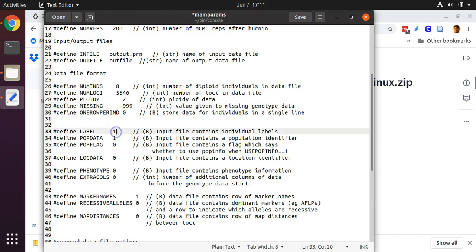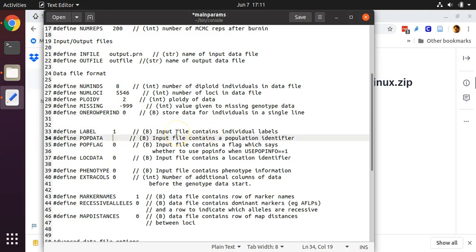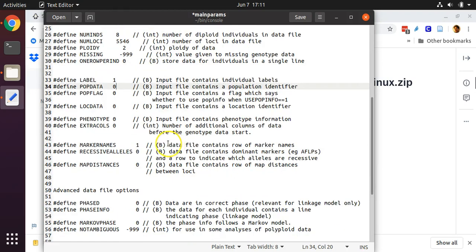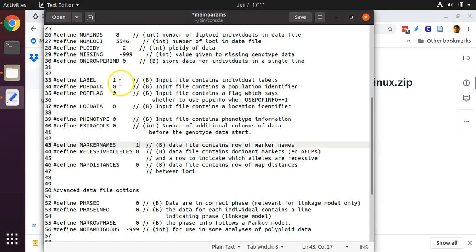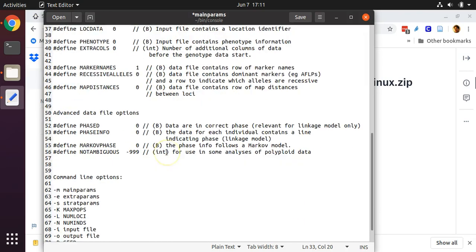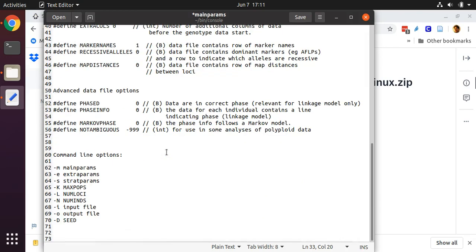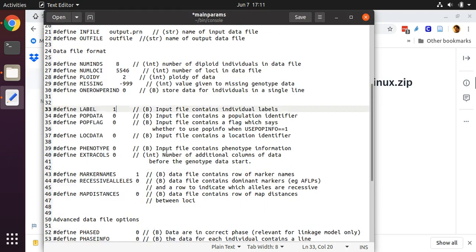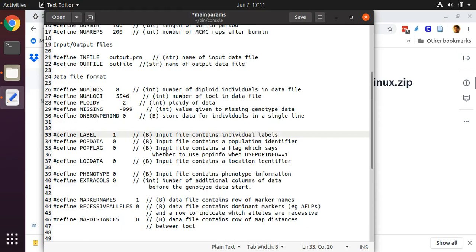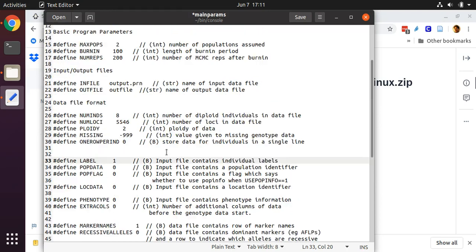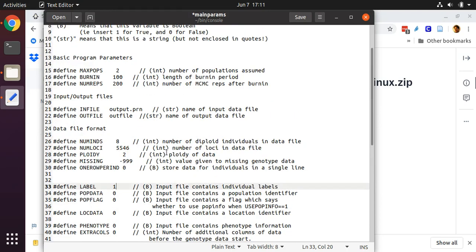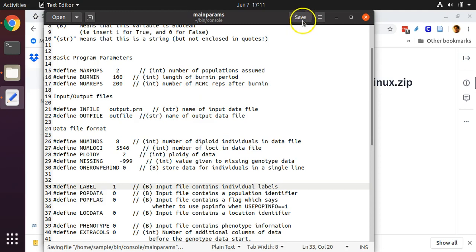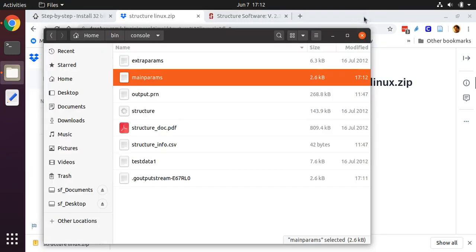Our data contains labels for the individuals. We do not have data about putative populations. Our data contains a row of marker names of labels for the loci. So we keep that as a 1, and we keep that as a 1. Next, we hit ctrl S to save, or you can click this button here for save. Close mainparams.